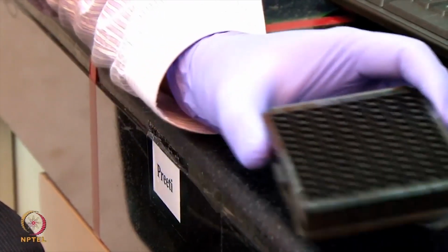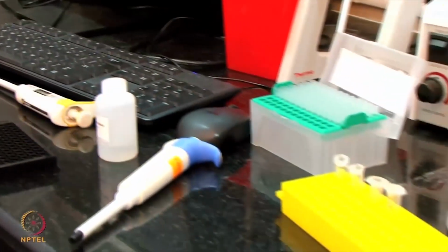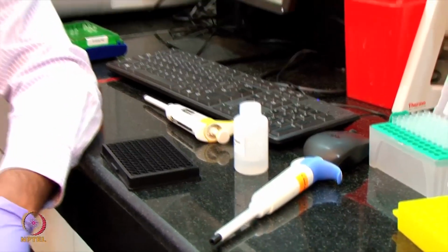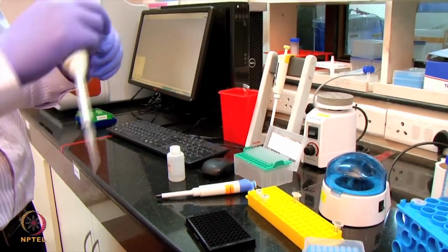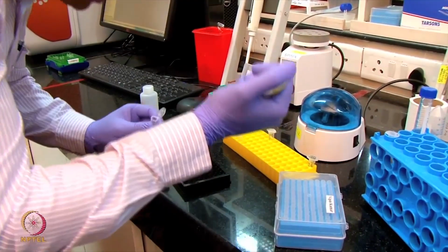Now I am going to add the unknown samples. We have 3 unknown samples here, which I am going to put in B3, B4 and B5. With these 3 unknown samples, we are going to determine the concentration of the unknown apolipoprotein using the standard. Now I am going to add the 3 unknown samples here. I am going to place at B3 the sample number 1.